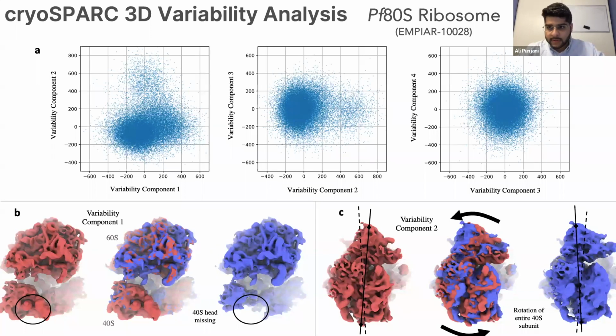And what you'll first see here is that these images look and actually are qualitatively very similar to those cartoon drawings that I showed earlier of the space of all particle images, except now, instead of looking at this extremely high dimensional and impossible space, we're looking at a very small 4-dimensional subspace where every particle image is laid out neatly, and we can see how they're arranged, how the topology and geometry of that space is arranged, and what the relationship between different particles or their clusters are.